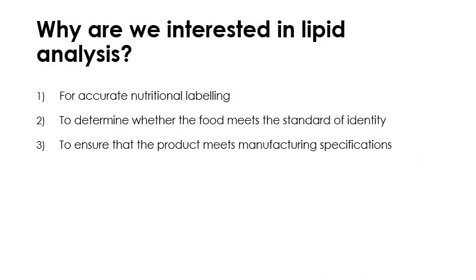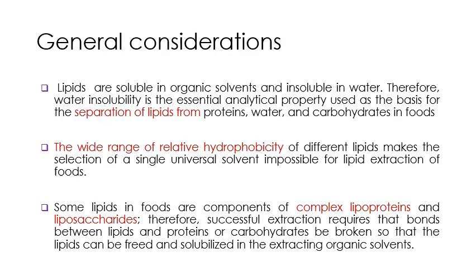Lipid analysis is important for accurate nutritional labeling, to determine whether the food meets the standard of identity, and lastly to ensure that the product meets manufacturing specifications. Prior to lipid analysis, there are a few general considerations.